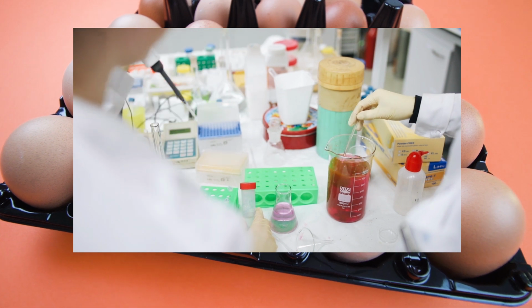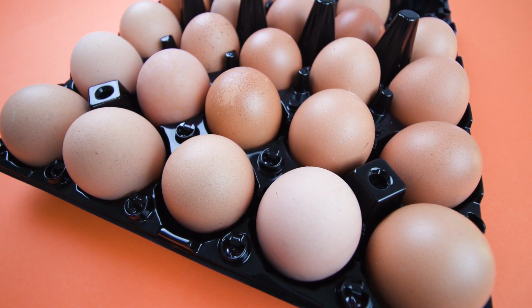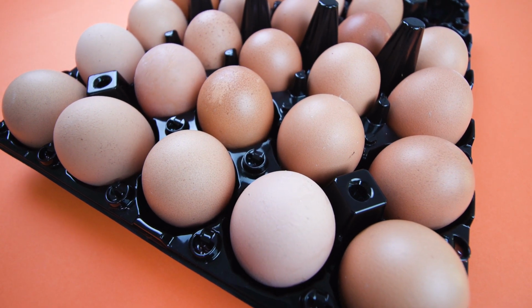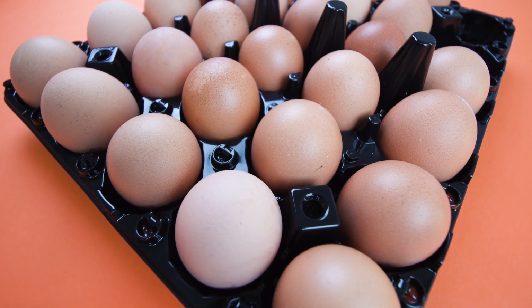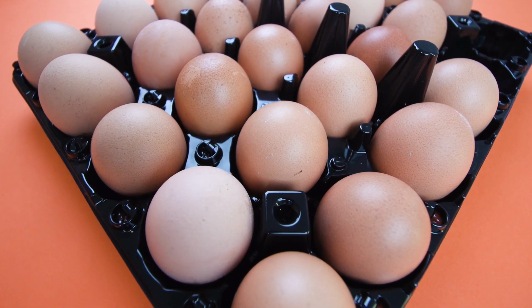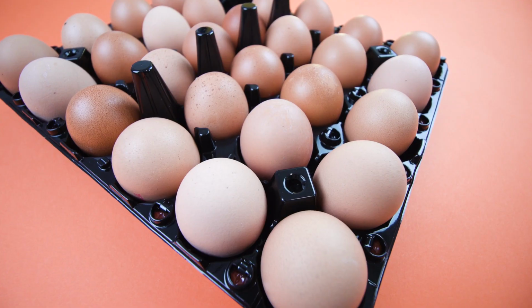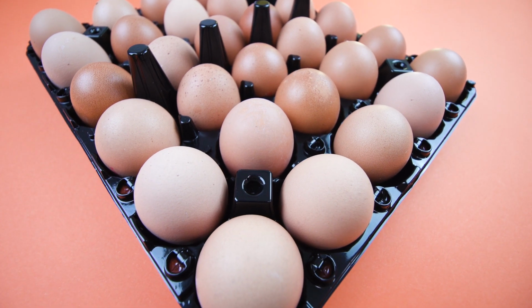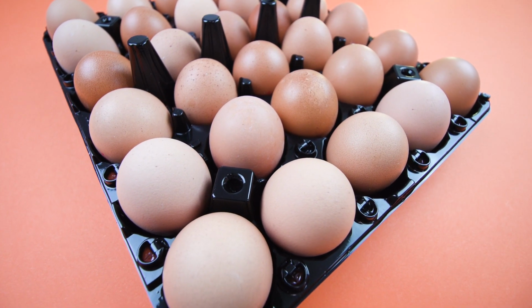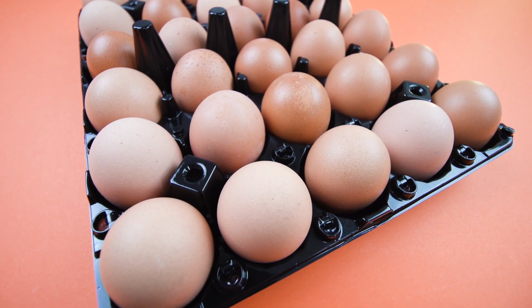The method is also relatively straightforward, meaning lower skilled labor is needed to perform a repetitive and simple task. The process begins with fertilized chicken eggs. Fertilization is key, as the eggs must have living cells for the virus that is to come. The fertilized chicken egg has been fertilized and cells start to proliferate. This means you go from 1 cell to 2, then 4, 8, 16, and so on. This is the basis of the vaccine. These eggs must be supplied daily to ensure continuous production.